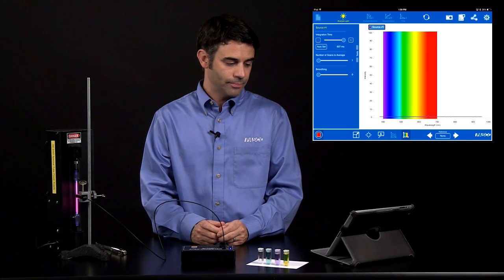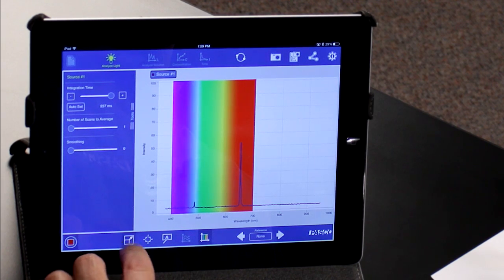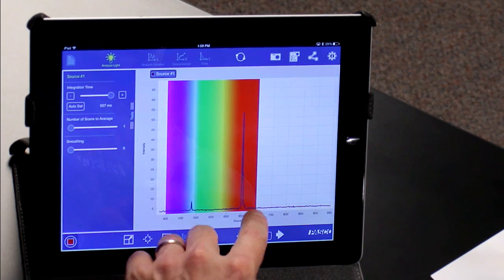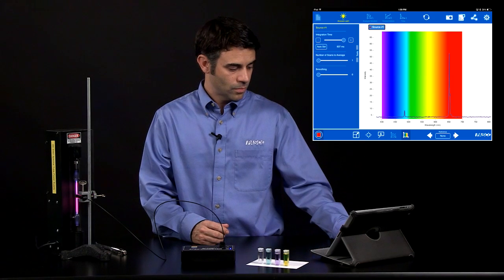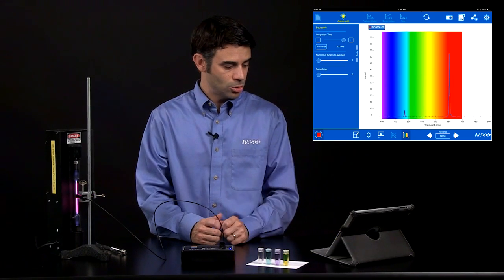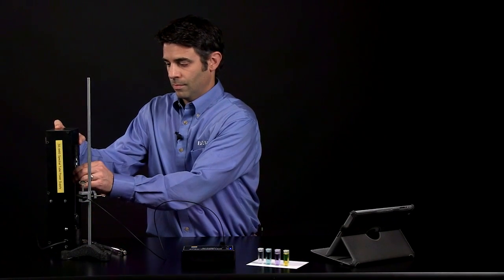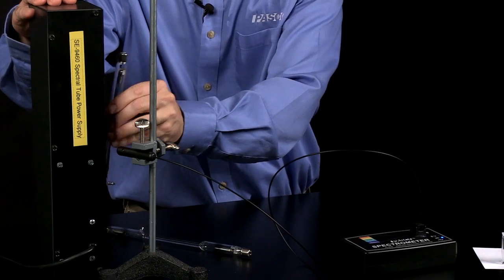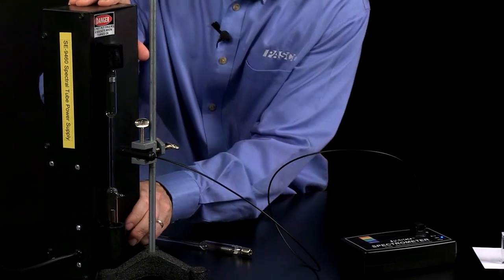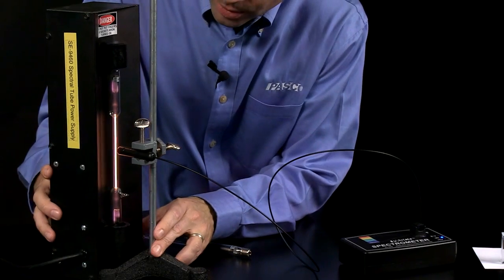After that process is complete, you'll see more peaks on your spectrum. You can auto scale that. And there's our hydrogen emission spectrum. I'm going to stop this and put another tube in just to show you something.